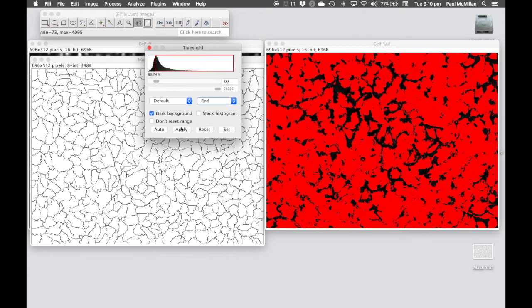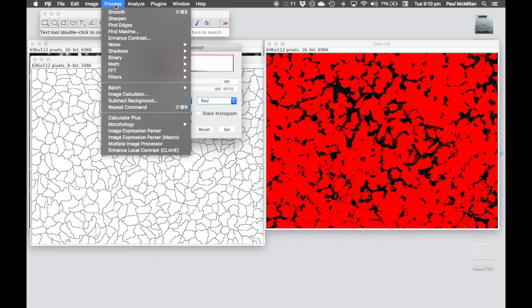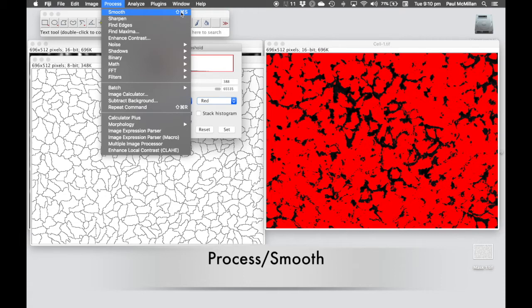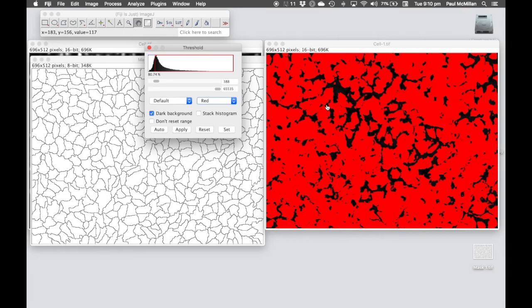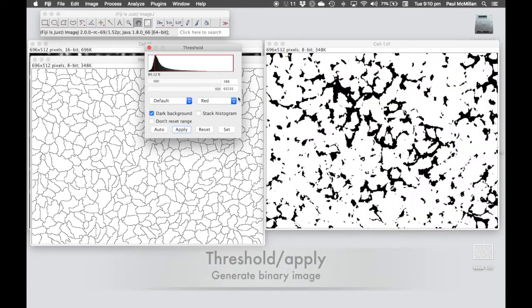At this point, hit apply. There's a lot of rough edges and extra little bits going on here that's going to complicate the analysis. We're going to clean that up a bit by using process smooth or Ctrl Shift S. That's got rid of some of that finer detail. And now at this point, we can hit apply.